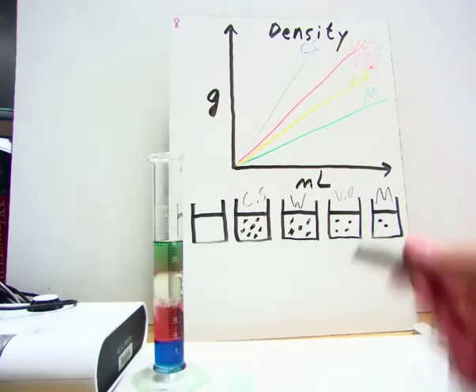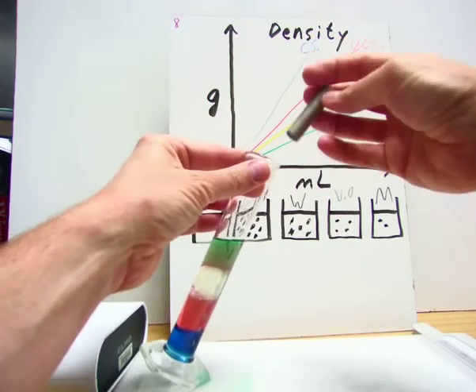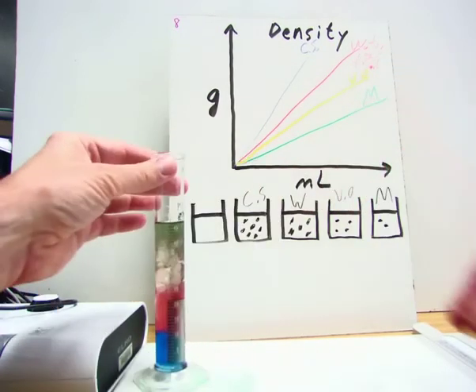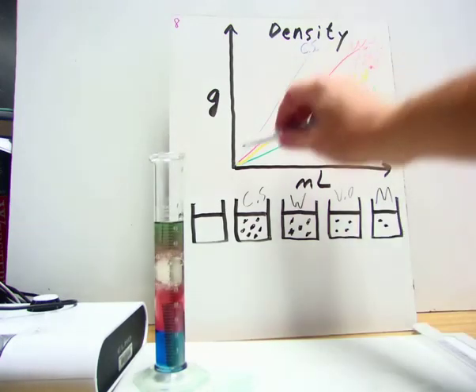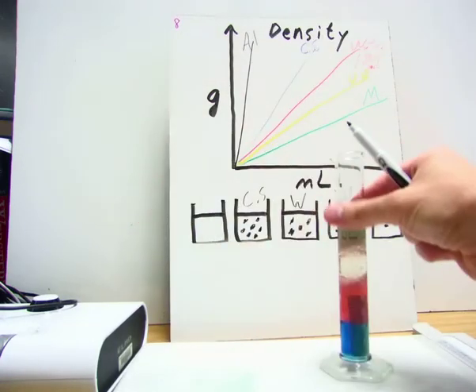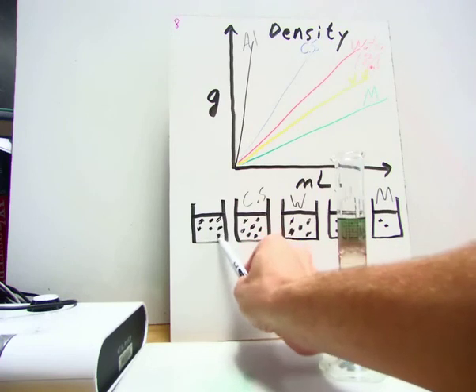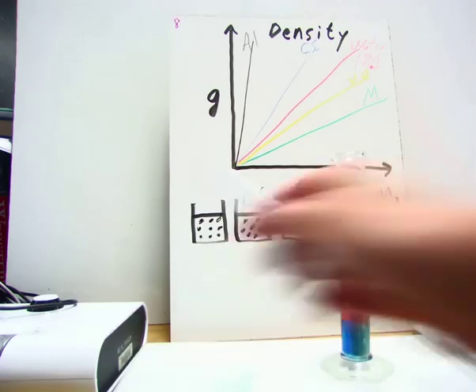And we can put anything in there, solids, liquids. This is a piece of aluminum from our density of solids lab last week. Once it's all done mixing up and settles out again, we can see that the piece of aluminum is certainly more dense. So in the same volume, the aluminum has more particles than the water or the corn syrup or any of the other materials. So this was 2, 4, 5, 7, put 8 or 9 in here for the aluminum.